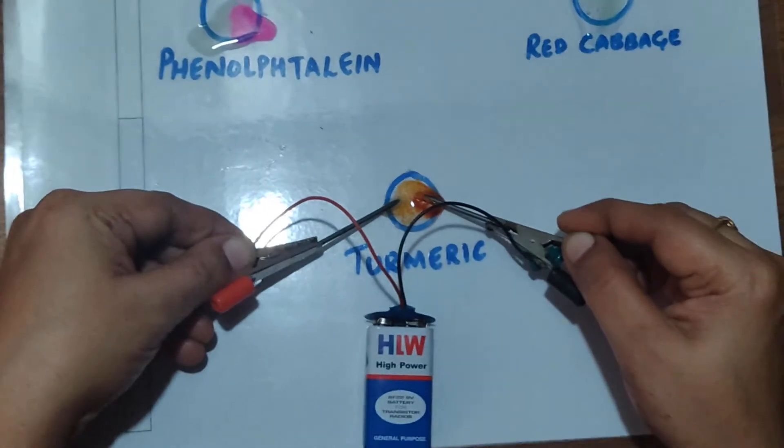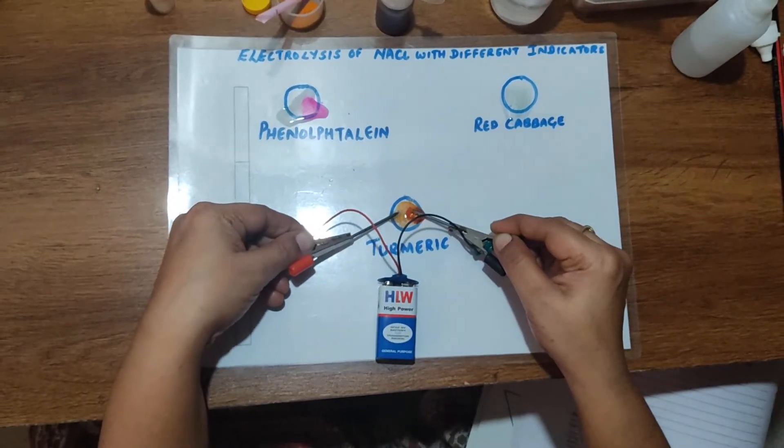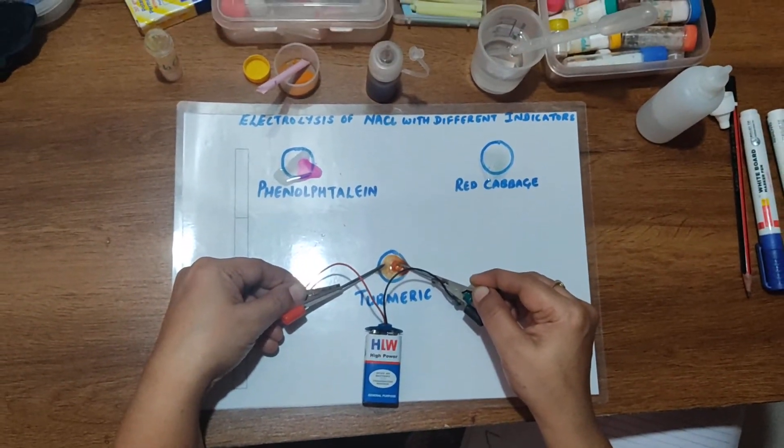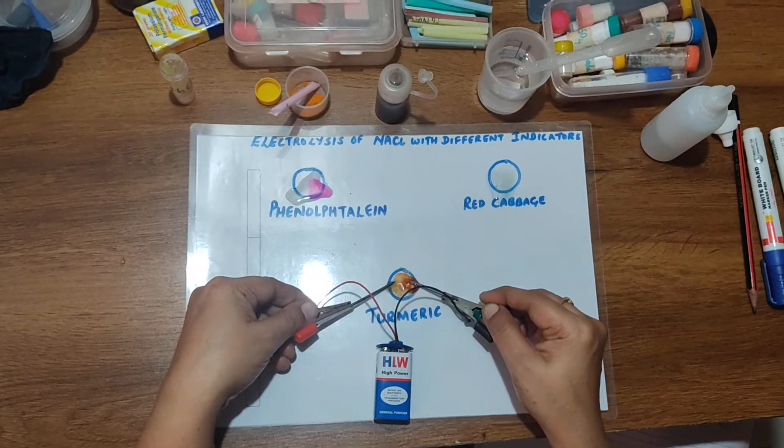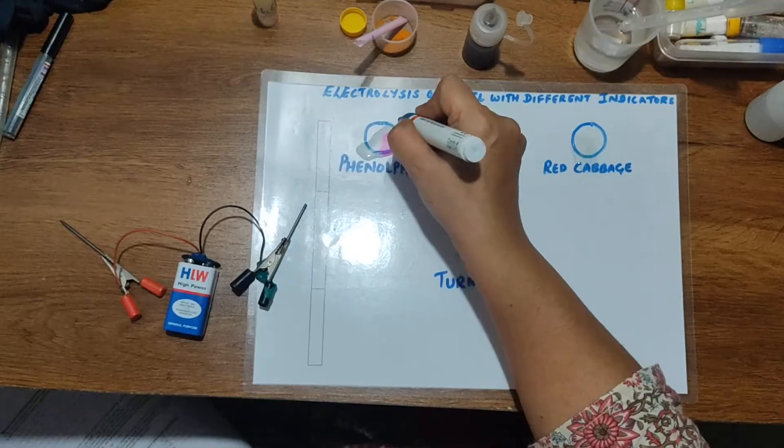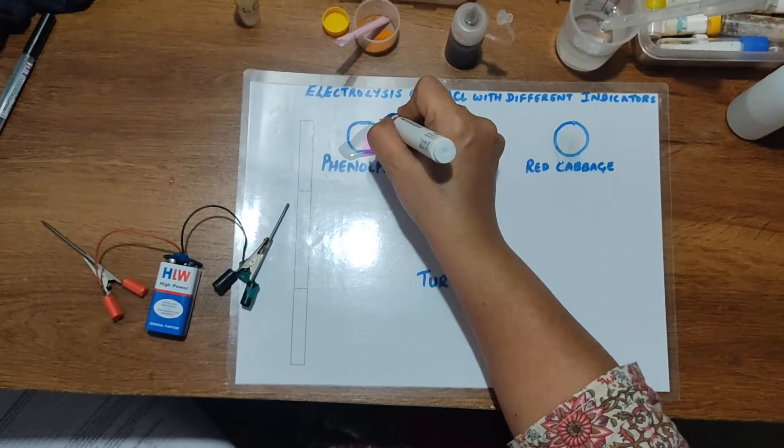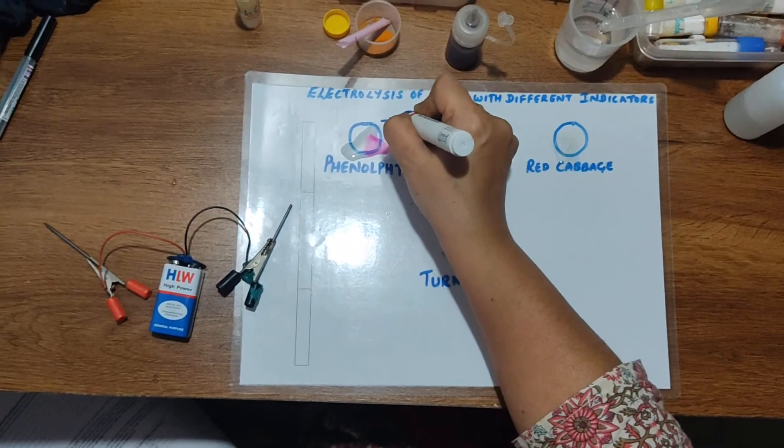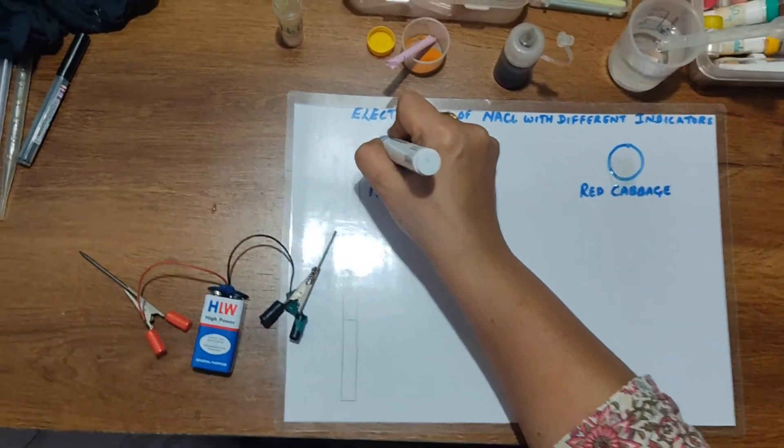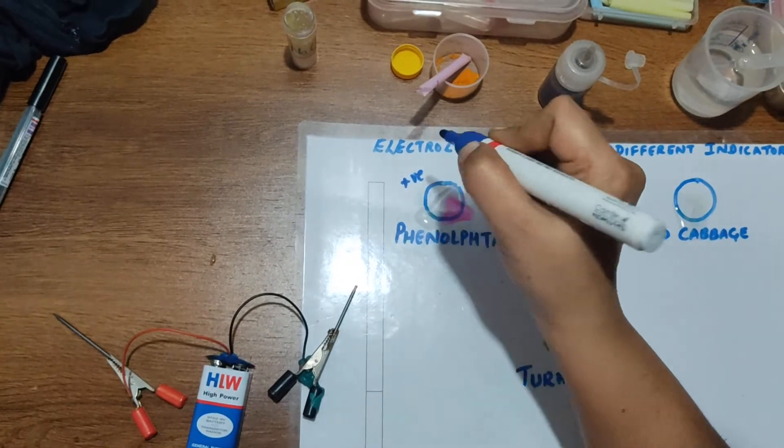So this is a very simple experiment to show electrolysis of sodium chloride. This is a simple redox reaction. This is the negative electrode and this is the positive electrode.